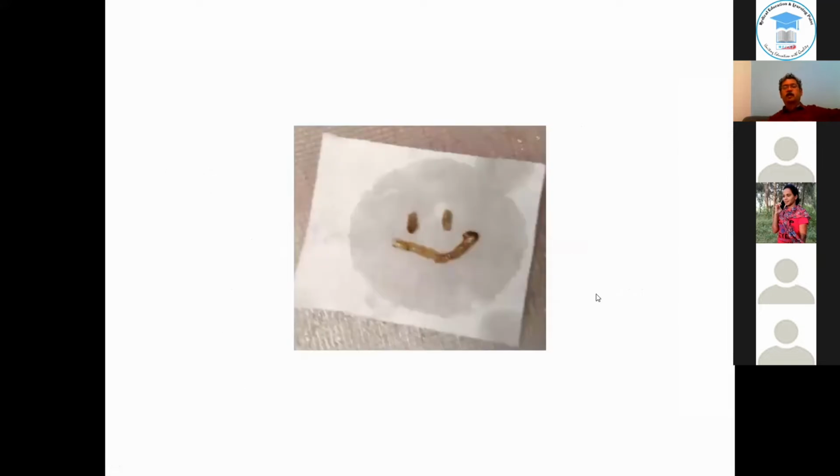And yes, would you believe it if I told you that it is purely by chance that I got this image? I dropped this trephine while I was about to put it into a cassette, and I realized it looked like a smiley. So I took this photograph some years ago in the hope that I would be able to use it sometime. And indeed, here we are able to use it. So this smiley is accidentally prepared and is a bone marrow.